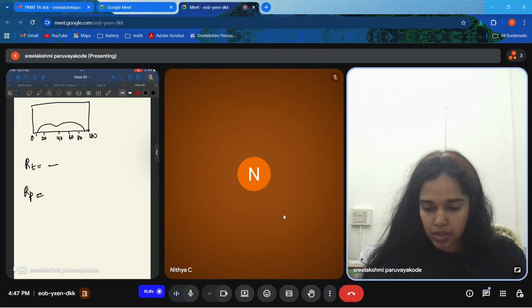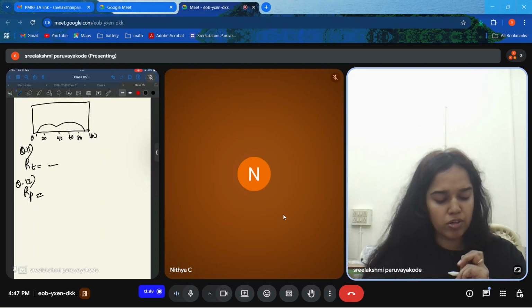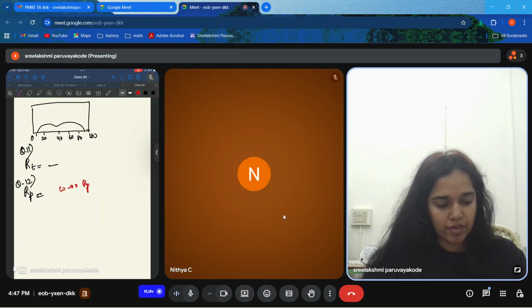So this is question number 11, this is question number 12. Let me go to question number 12 first. We know omega tends to 0, we get the RP value, which is nothing but this point, right? This point is RP. So it is coming between 80 and 100. I can say it is 90. But is it directly 90?